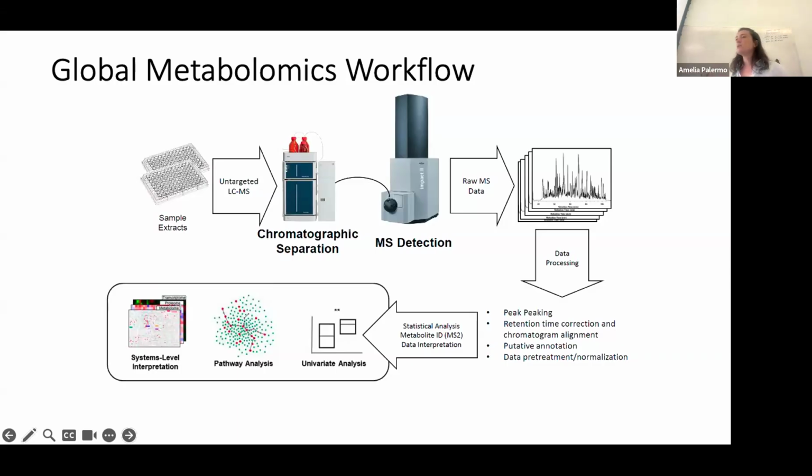The ionization can be performed in positive and negative mode, depending on which type of potential we apply. In positive mode, the potential will usually add a hydrogen, so a charge of +1 on the molecule, on the molecular mass. The negative ionization will add an electron, or remove a hydrogen, depending on the perspective you want to take. But the final result is putting a charge on our analytes, and that is important because it is needed later on in the mass spec.